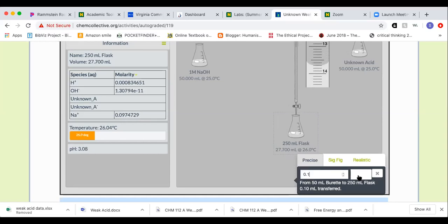And again, this is not super difficult to do, especially once you have the simulator. What I would do is probably do this in Excel as well, and then just type over your pHs, and that way you do it once. As you scroll through and do enough trials, you'll keep adding, and then see, there was our jump, right?